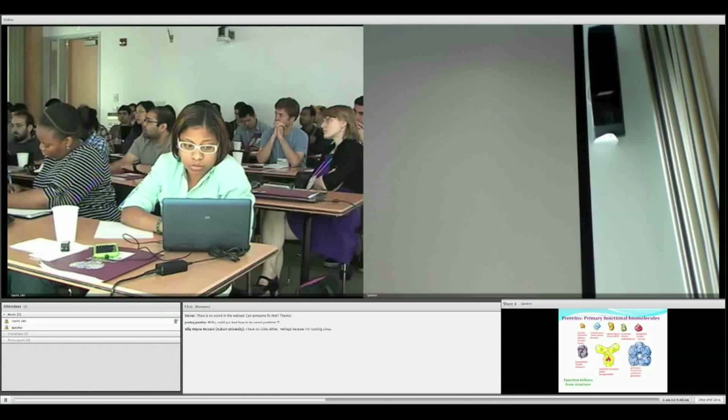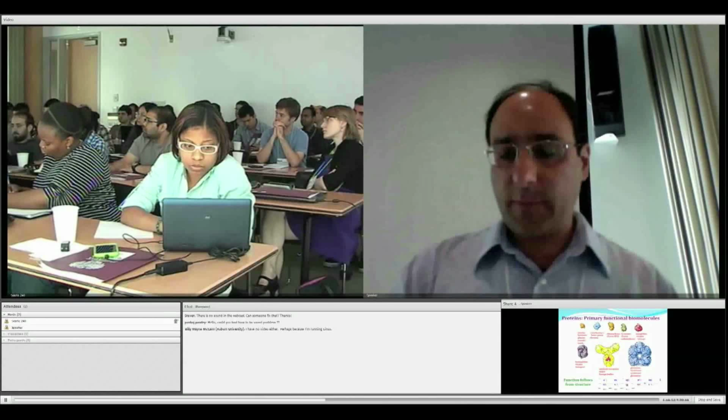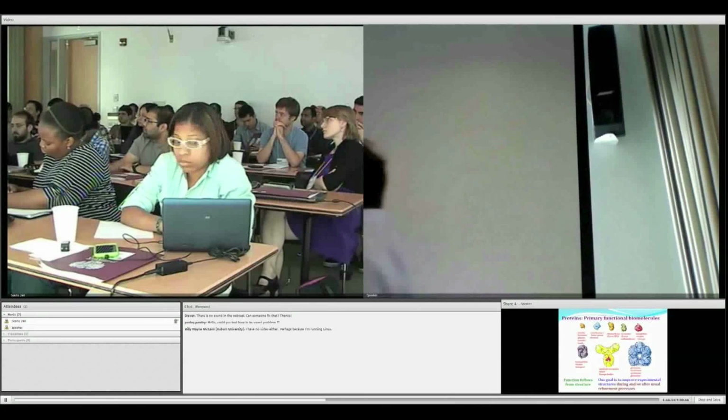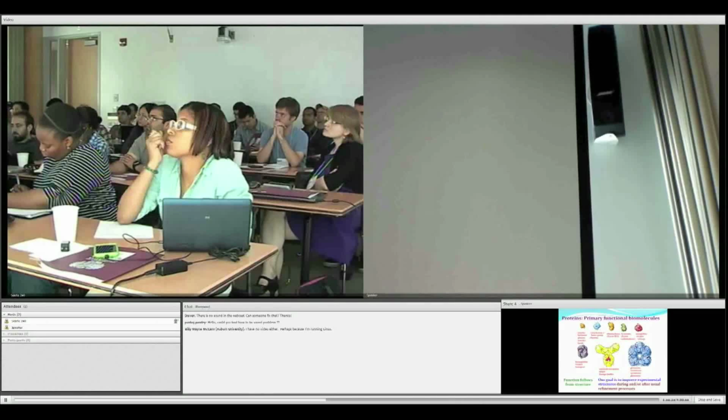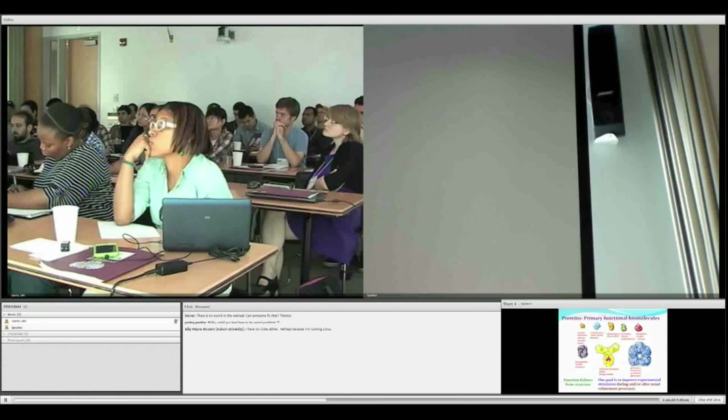There are lots of very powerful crystallographic refinement packages that people use. If you use them and then come to this server, you will gain something, but the gain would be minimum. The important thing is that you try this at the various stages of the refinement.